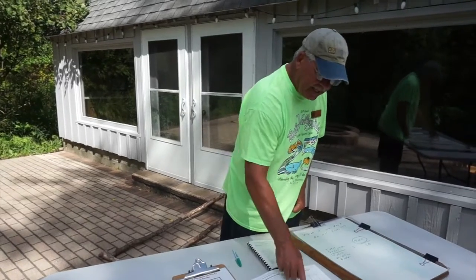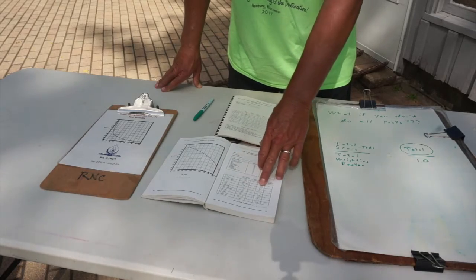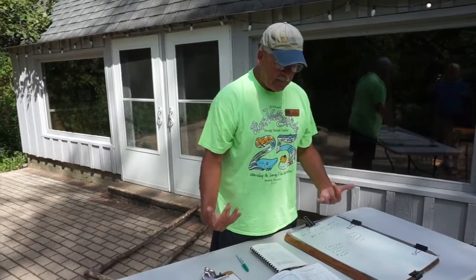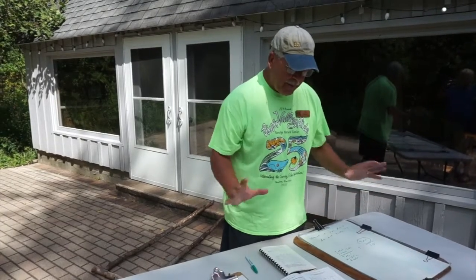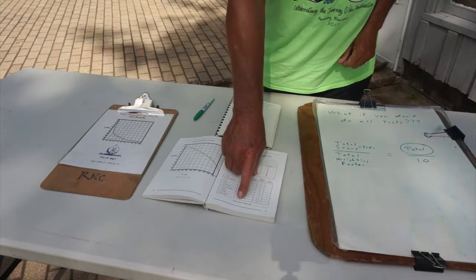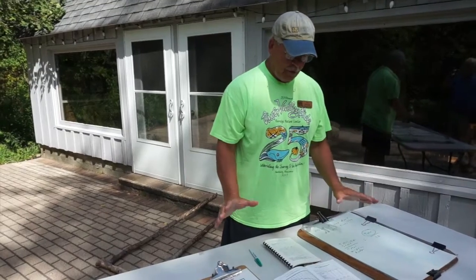Same with a test like this. You may get a score in the B range, but you look at your fecal coliform test and you scored in the F range. Now you can focus on something that needs to be corrected. So the overall number, that's nice. It lets you compare rivers to rivers. But you always want to make sure that you're looking at the individual data, because that individual data tells you where there are problems. And no river is ever perfect. There's always going to be flaws in those.